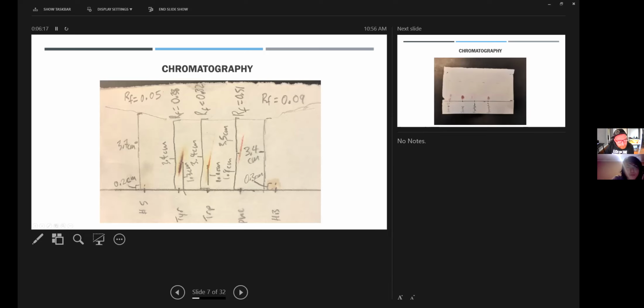And the histidine. The RF values on our histidine and our unknown are very, very close. You can see that we measured it at 0.3 centimeters for the histidine, and we measured ours at approximately 0.2. So thankfully, with that, we had an idea. It looked like the NMR was telling us that we had aromatic molecules. We went and tested aromatic aminos, I should say.